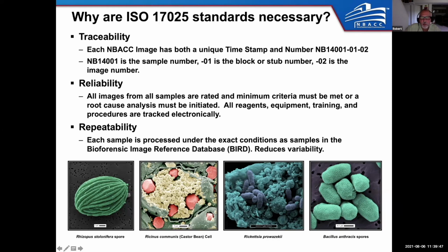The green stuff is cell wall material. The yellow gold stuff here is castor oil, also known as ricinoleic acid. It's an excellent industrial lubricant, which is why we grow these castor beans. But the red stuff is things you do not want from castor beans. The red things you see here are actually crystals of ricin protein.